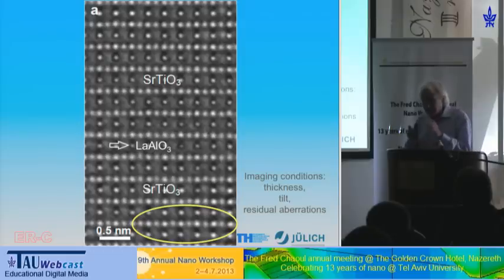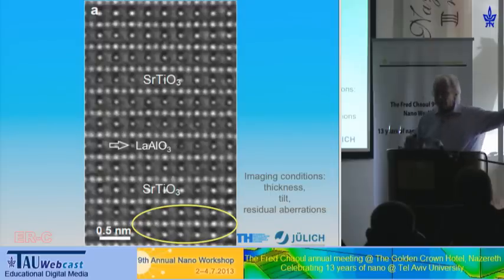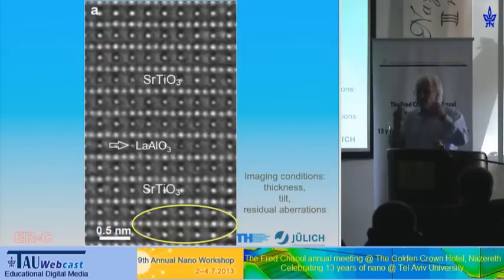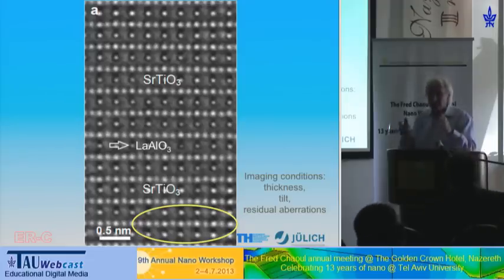And here I should briefly mention that we need this area also for something else. When you adjust your microscope, maybe at 8 o'clock in the morning, and you take such images at 8:30, it's quite likely that the correction values which you have adjusted have shifted away. So your correction is not what it should be. That's the reality at the forefront of electron microscopy.